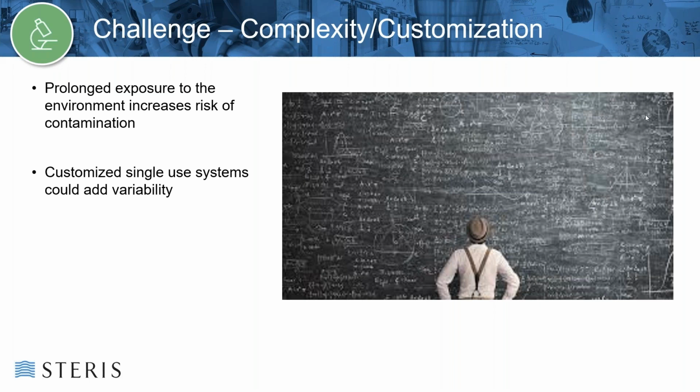Customized devices also, single-use systems, also add variability. So for the validation of that product, perhaps a worst case product is developed to represent all of the variability that could occur within that portfolio of products that are sold.